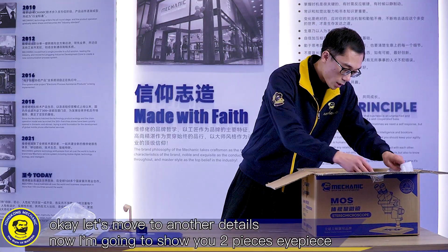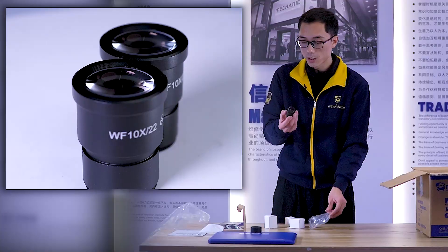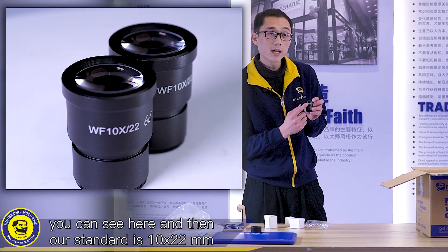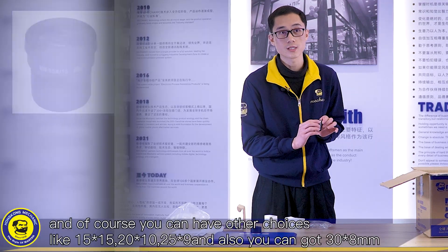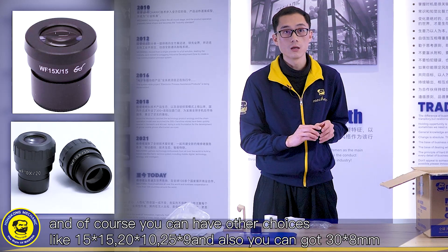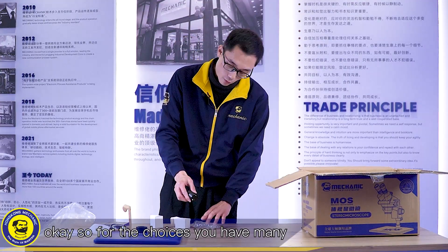Now I'm going to show you the two-piece eyepiece — it's our standard one. Our standard size is 10x22mm. Of course, you can have other choices like 15x, 20x10, 25x9, and also 30x8mm. So for choices, you have many.